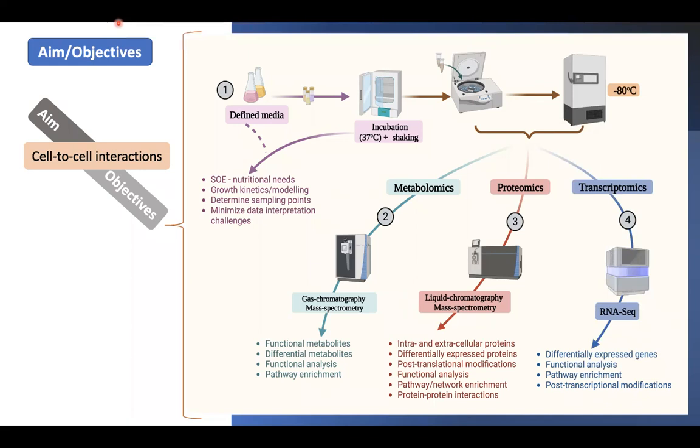I'm at the point of doing the mapping of the transcriptomic data, trying to do the genome mapping and to continue with the analysis. But for now, I really only have the QC information. That was the only thing I did. So I'm just trying to generate the library and then do the mapping and proceed from there. For now, I don't have much information.